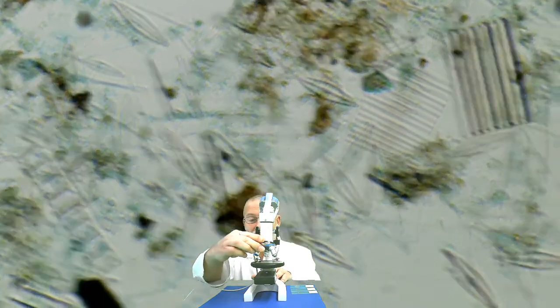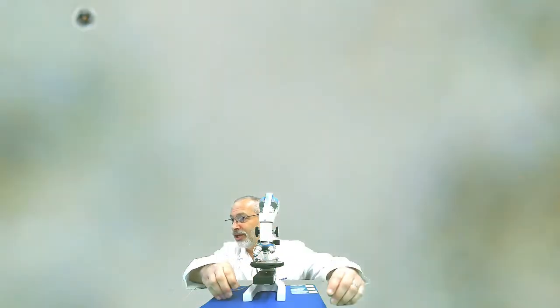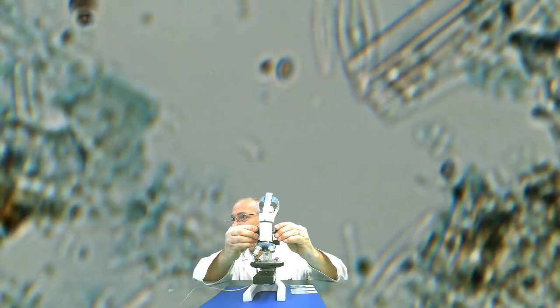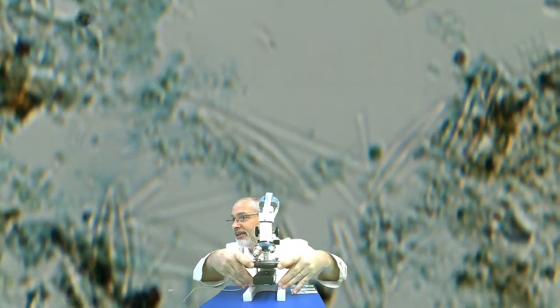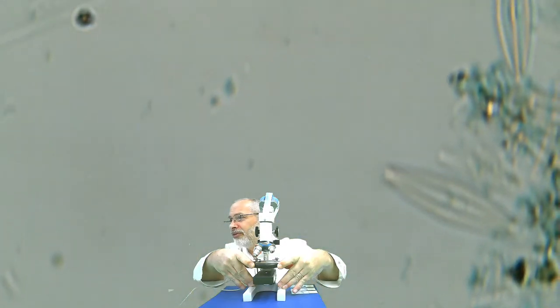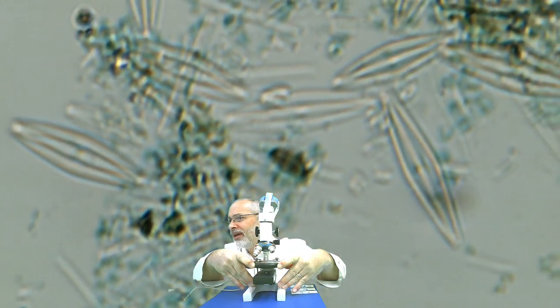All right, and now let's head over to 100 times magnification, and I'll try to make this a little bit easier for you. I will zoom in. Let me find an easy one for you to draw, because some of them are a lot more difficult than others, that's for sure. How about, here we go.